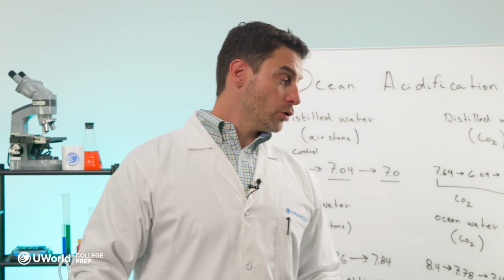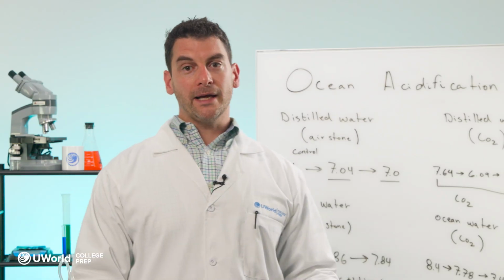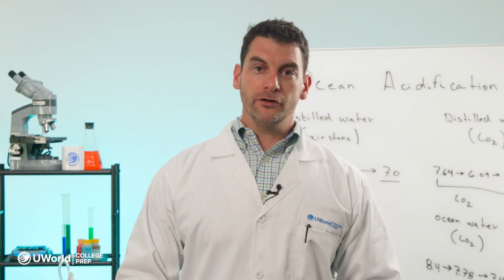So after looking at these data, we can see that the largest drop happened in plain distilled water with CO2. No salts, no buffer, maximum acidification. The smallest drop happens in seawater with sodium bicarbonate. In fact, there's no change at all that happened, and that's because the sodium bicarbonate binds the hydrogen ions that are created when the CO2 reacts with water.